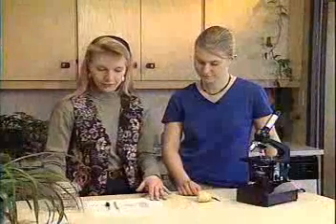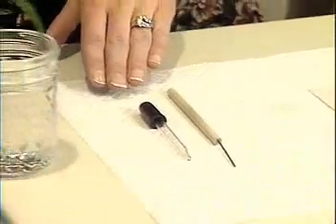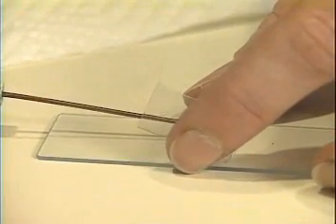So to look at potato cells, I'll need a light microscope. And a wet mount slide of a specimen. Right. Here's a glass slide, a cover slip, a dissecting needle, and an eyedropper with some water. Now you can prepare a wet mount slide. First, I'll cut a small wedge potato with a scalpel. Then smear some potato cells from the wedge onto the center of the slide. Add a drop of water. Touch the cover slip to the water and lower it onto the slide with the dissecting needle.